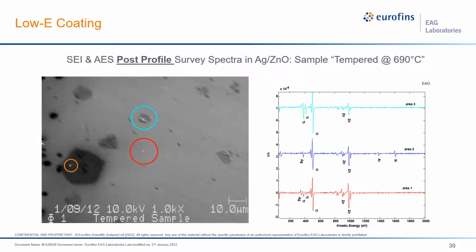And once we go through that layer, we don't basically see silver anymore, because in that part of the profile, the silver is thinner, or it has a void, and that gives us an idea where the problem might be. And then perhaps the other thing we would do is go in and do a TEM microscopy right at that cross section.